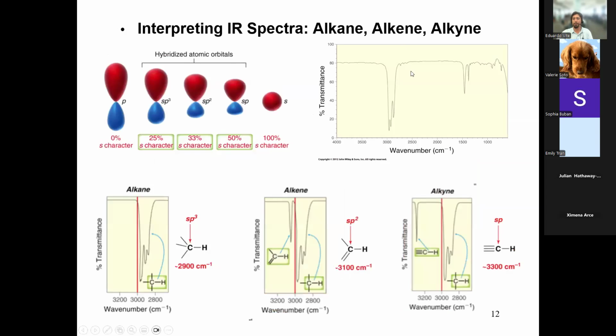So let's start with the simplest thing that we can think of. Just carbon hydrogens, right? Hydrocarbons, no oxygens, nothing else. Let's just start with carbon-hydrogen molecules all by themselves. Have you guys started nomenclature in your lecture? Have you started talking about how to name compounds like hexane, pentane, butane, propane? Are you guys familiar with this stuff?